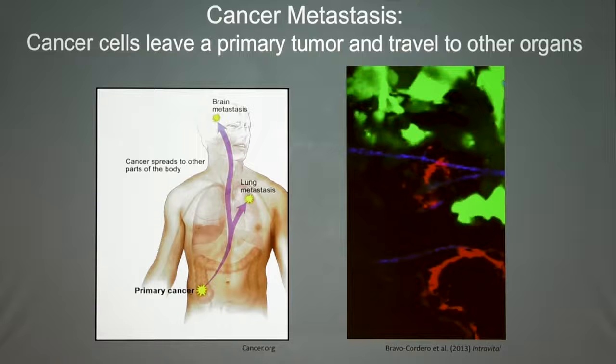So cell migration is really an important and deadly aspect of cancer, but it's also a really difficult thing to study because normally we can't see through humans or mice to be able to watch these cells moving. Our microscopy techniques are getting better, and we're able to take these short little movies by making a little window in the skin of an animal. But there's a lot of technical challenges with doing these type of experiments, a lot of limitations to this method.